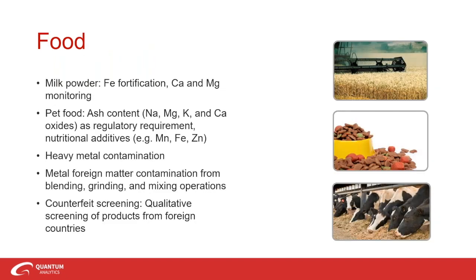Now for food and some chemical products, these can contain major and trace elements and contaminants which can be detected by XRF. This is exciting because you can do a number of different applications in food. One important application is monitoring nutritional additives to powdered milk. Milk powder can be measured directly by confirming minerals that are present in the appropriate quantities and the quality for control and compliance of these local regulations.